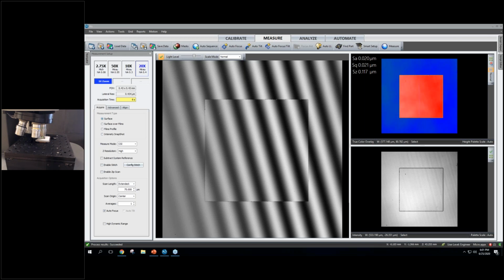To do the manual alignment, first right-click on whatever sites you want to use as the alignment sites. You can choose any that you want. In this case, I'm just going to use two along the very top row that are the furthest apart, site 1 and site 15. For that, just right-click on the site and go to Toggle Site Alignment and then Pattern Align. And that will outline that box in yellow, telling you that it's an alignment site.